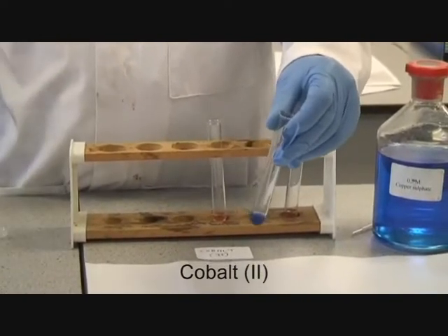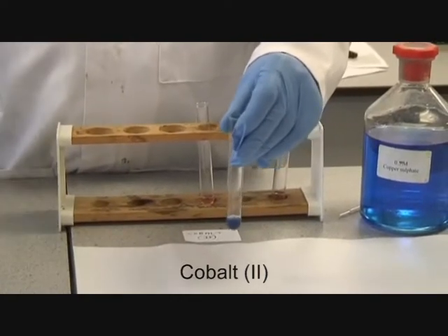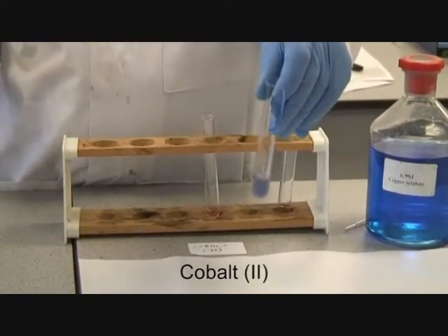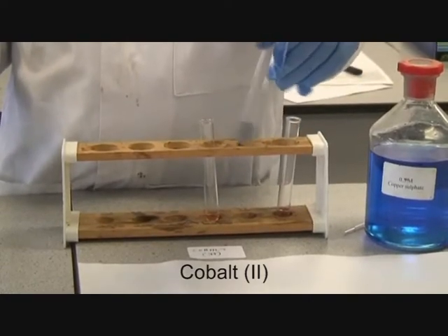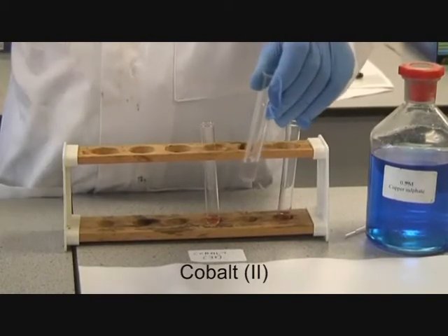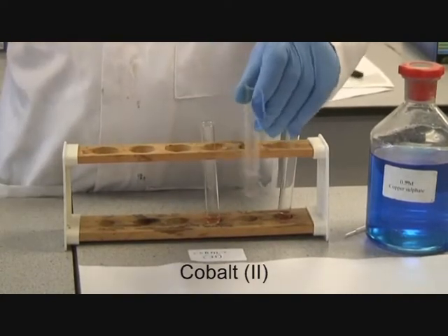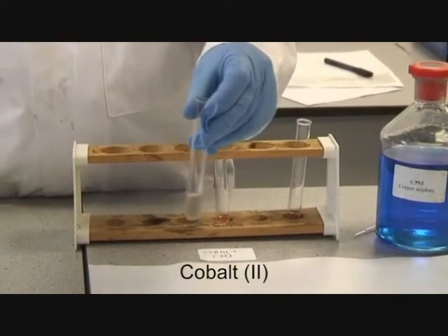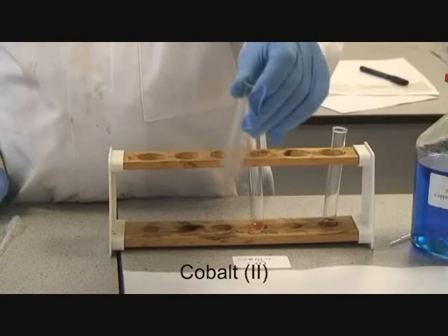We shall now add excess hydroxide to this, and note the effect. Nothing further occurs, until oxidation by the air turns cobalt-2 into cobalt-3, and that is the change in colour that you see.